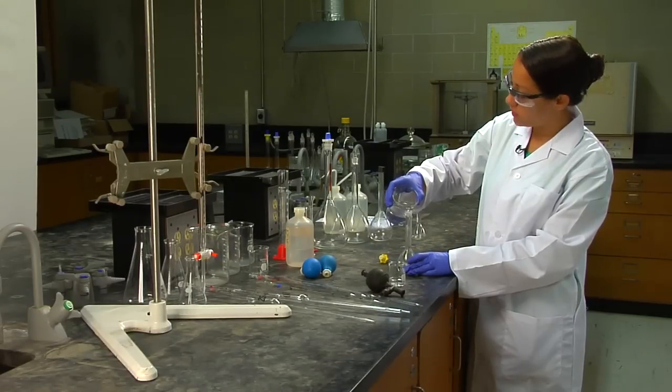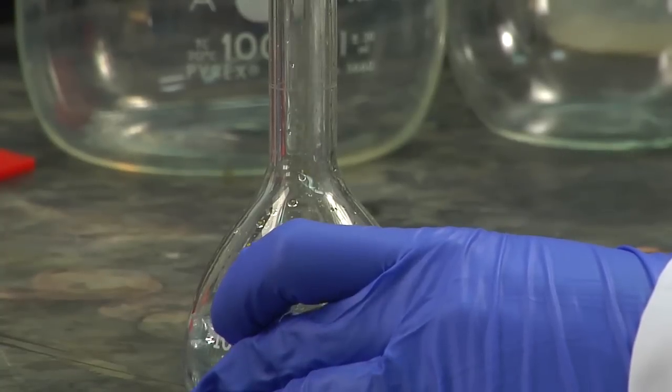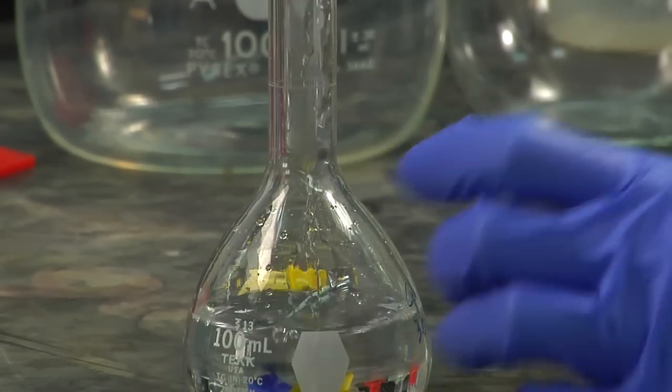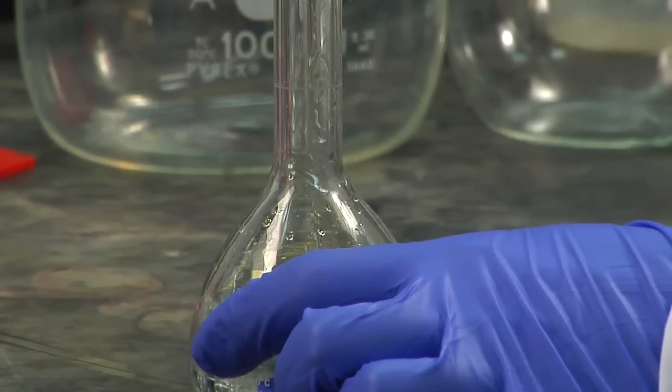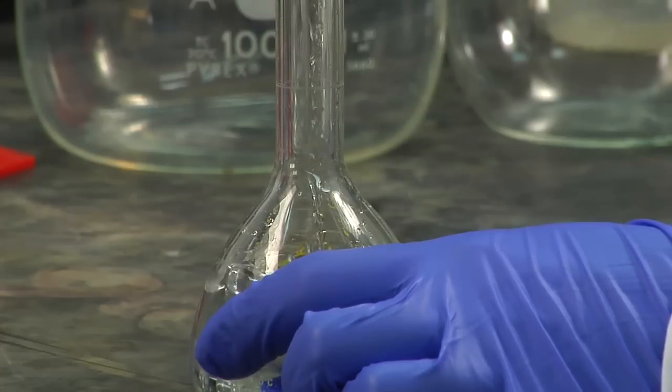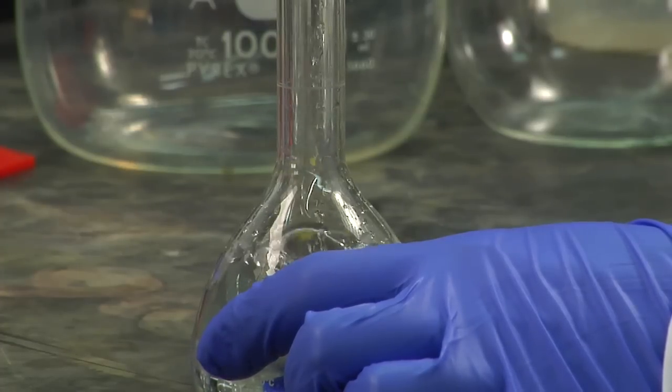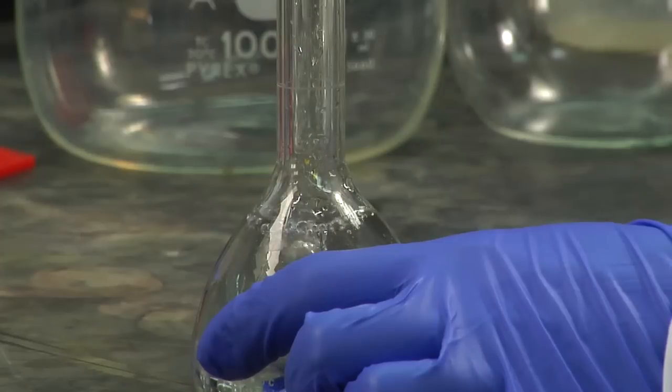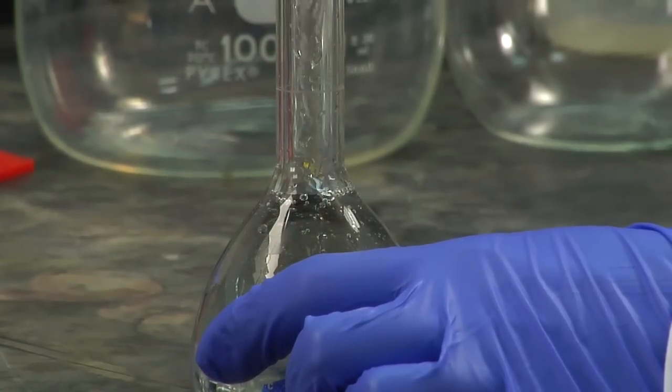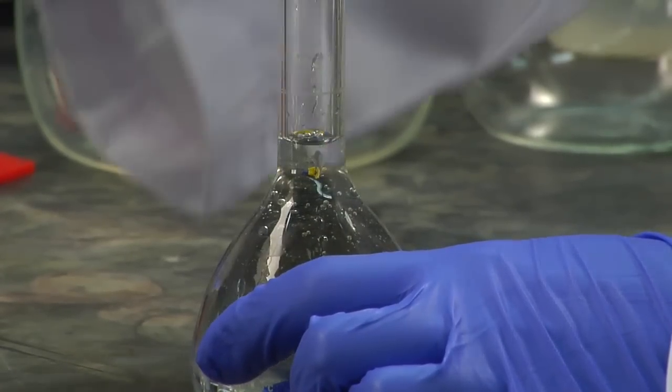The beauty of these volumetric flasks is that they're very accurate just because of the narrowness of this neck. Make sure you don't spill too much. This is a good time to make friends with your lab partner because this takes time.